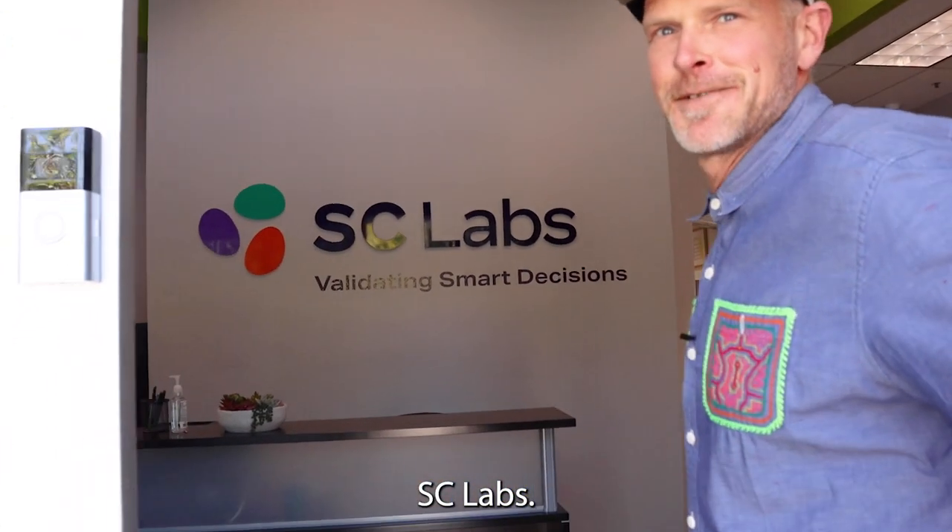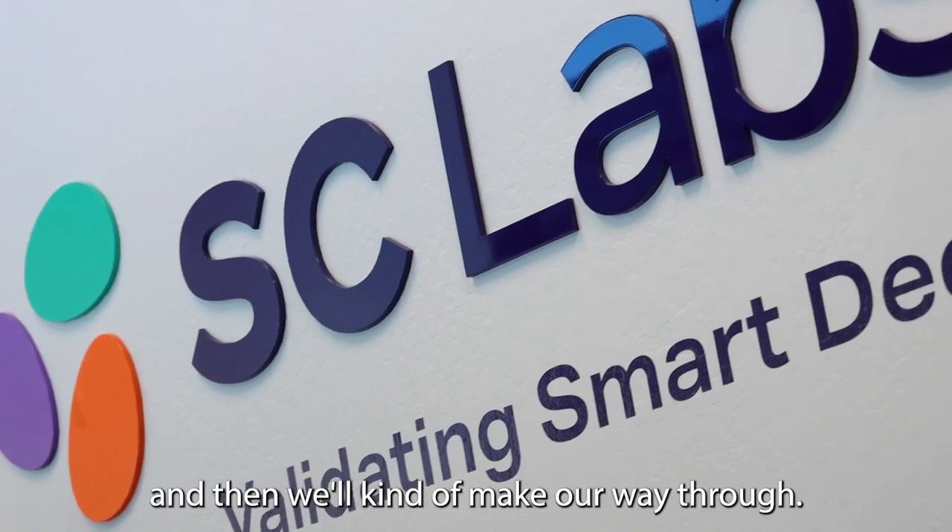Welcome to SC Labs. We usually start back here and then we'll kind of make our way through.